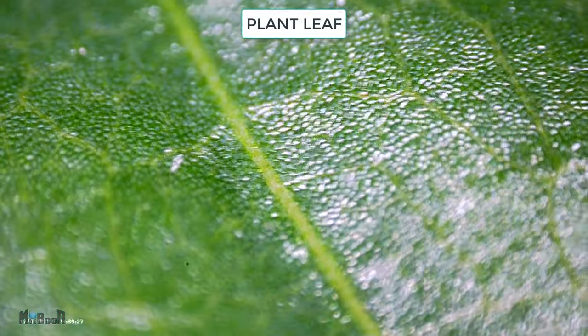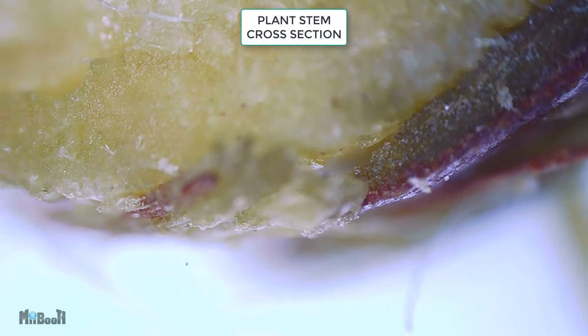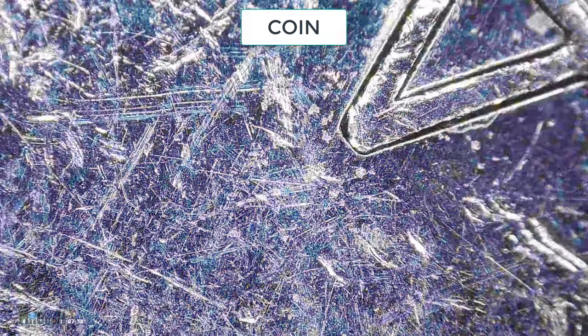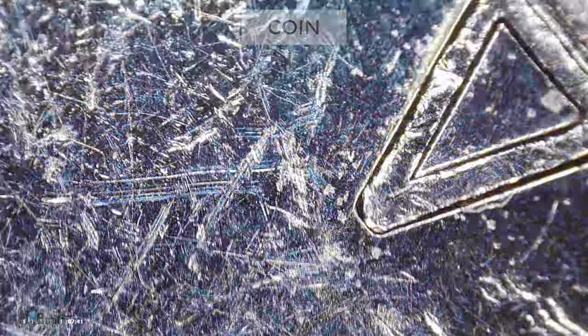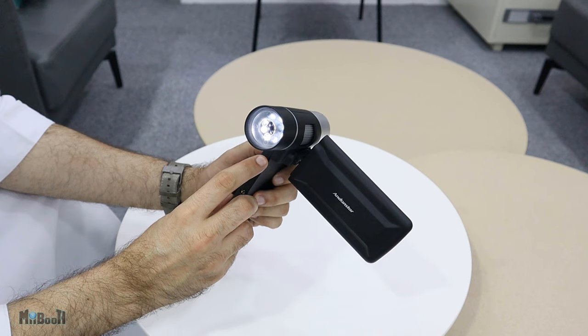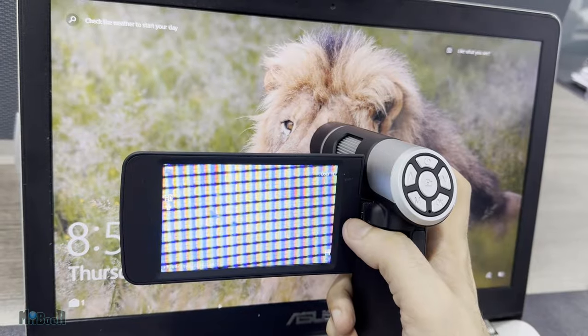The picture and video quality is quite fine. It's not a cheap gimmick and it's not cheap either — I found it on Amazon for $119 USD plus delivery. The colors are quite good, and with auto exposure it adjusts quite beautifully and relatively quickly. You can adjust the light level of the LEDs with the wheel in front, or turn them off completely — to see things that emit light themselves, like a monitor. Look at this: these are the pixels of my laptop display, which is 1080p. Each pixel is made up of three colors — red, green, and blue — which you can see clearly. Hence RGB.